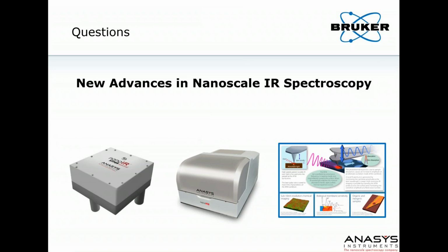However, that said, we are able to measure smaller and smaller features. A good example is some organic nanocontaminants are becoming not just very thin, but also essentially they're particles. So we're doing work there measuring very small particles, certainly not 10 nanometer by 10 nanometer, but not much larger than that. So the strict definition is transition from one feature to another, but yes, we can measure small particle-like features.